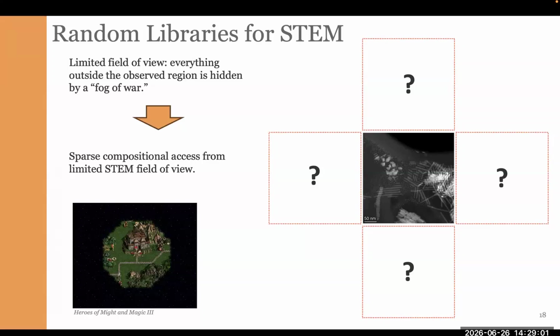Obviously, you can make a mapping, but it is time consuming. What we try to do is get rid of such mapping and rather develop an algorithm which enables investigation within such an environment.